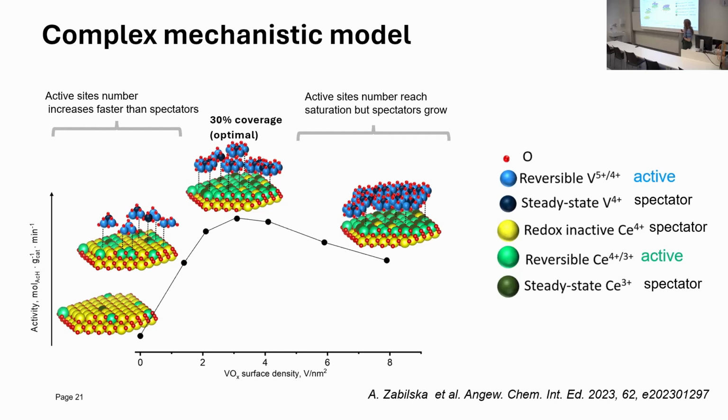And the concentration of these atoms increases a lot when you add much more vanadium, which makes the catalyst less active. It explains why there is an optimal ratio, an optimal loading of vanadium, to make the most active catalyst. It's actually about 30% of the monolayer that is the optimal concentration, but we can also see that the active sites are rather complex.